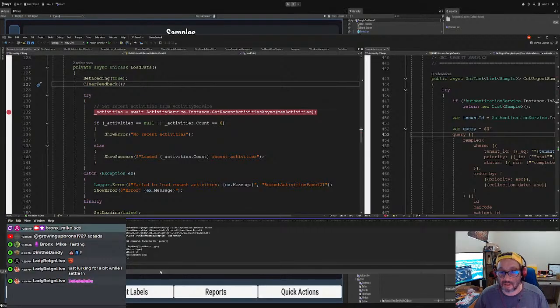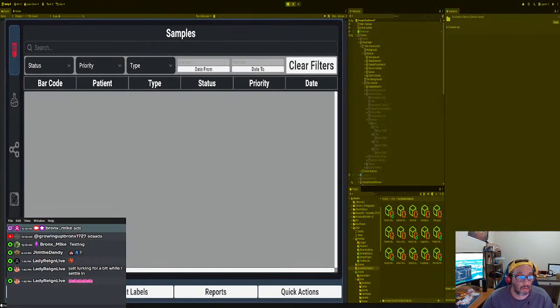All right. So let's just finish that. Okay, so that should work for right now. Let's go. Okay, boom. Shrink this down. And then we should get our queue service.